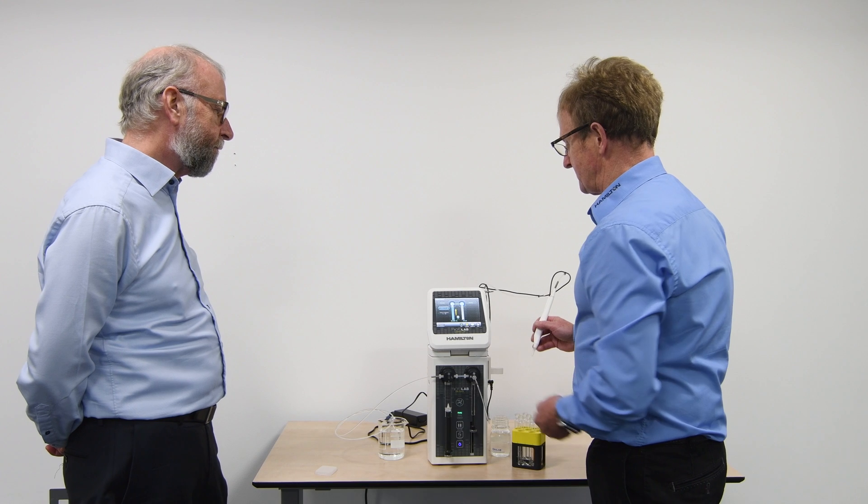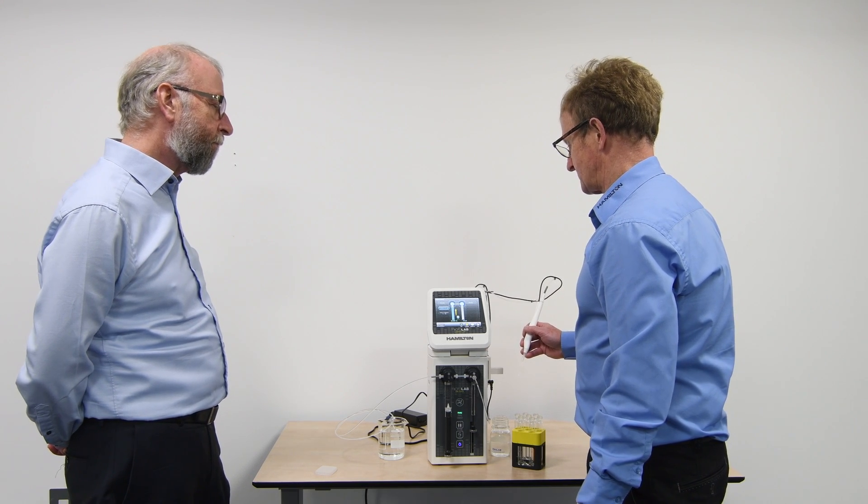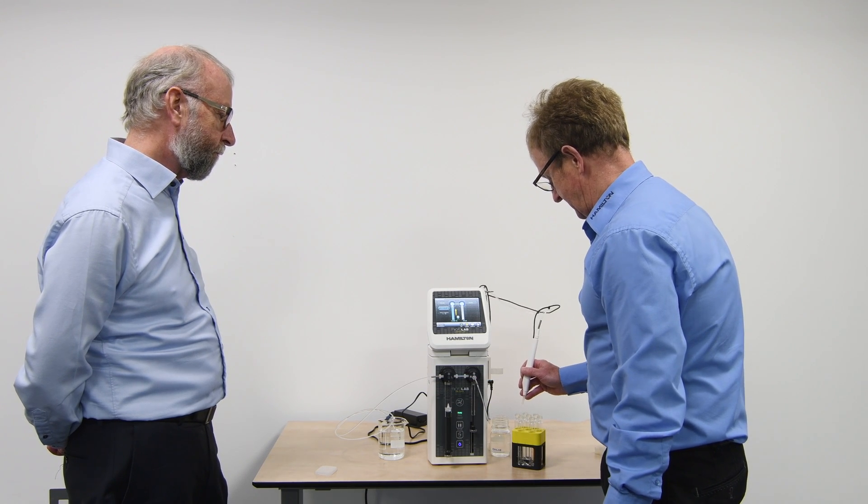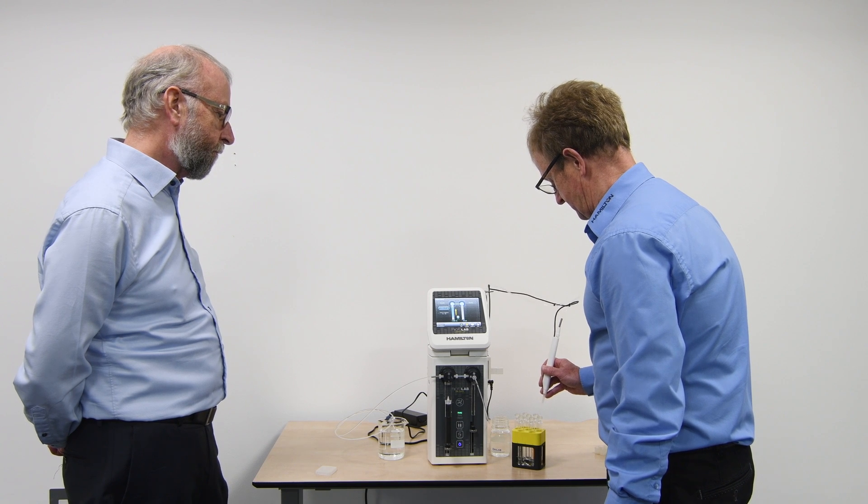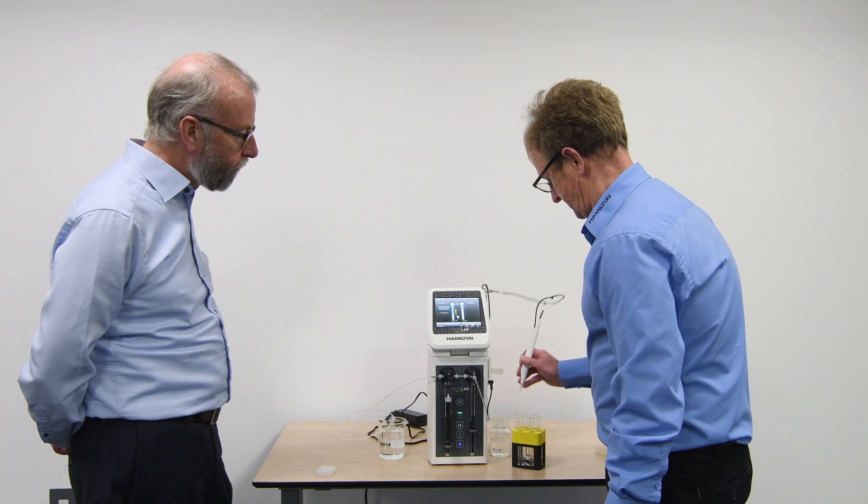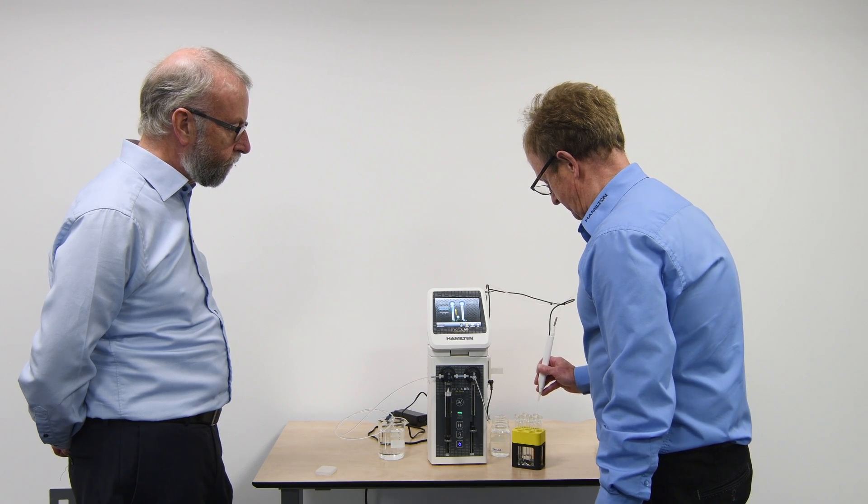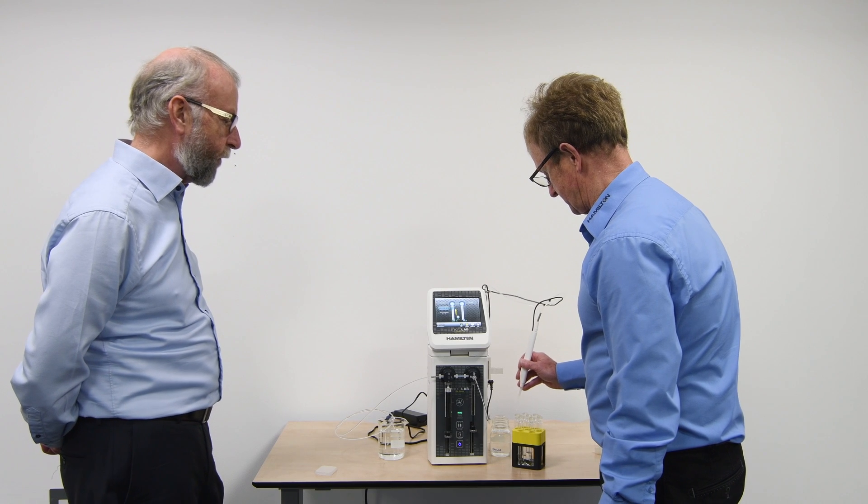The delay is minimal, as you saw. It only takes around sort of six to eight seconds to fill a 10 ml syringe, which is pretty quick. We're dispensing those amounts very quickly, very precisely, but also very accurately, because of that positive displacement system that the unit has.